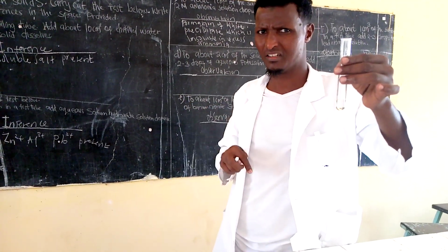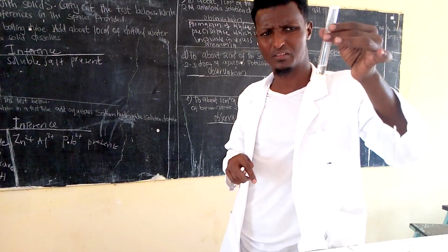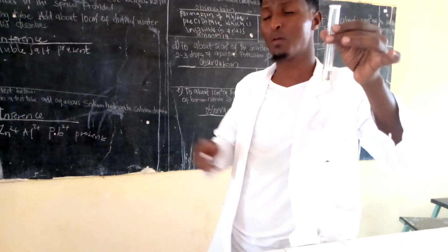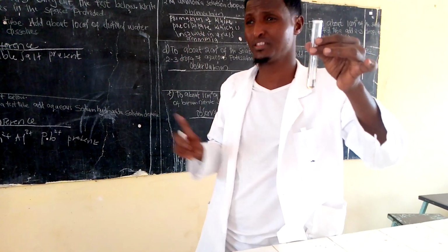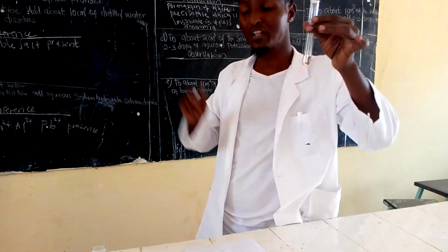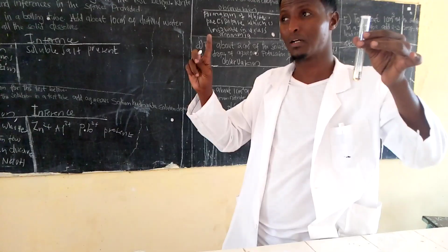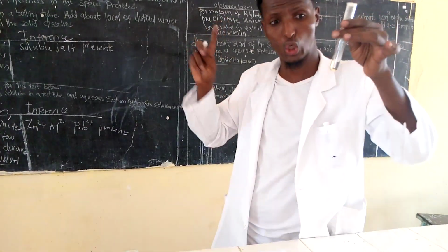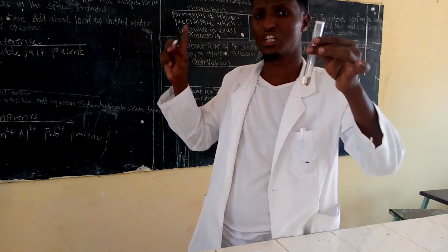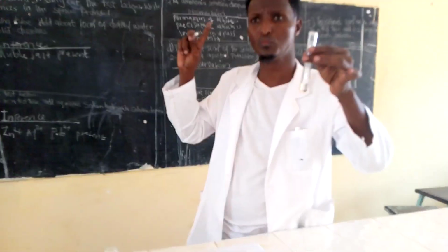It forms with lead. We were expecting a yellow precipitate, but we have not seen it, so we will say no yellow precipitate.